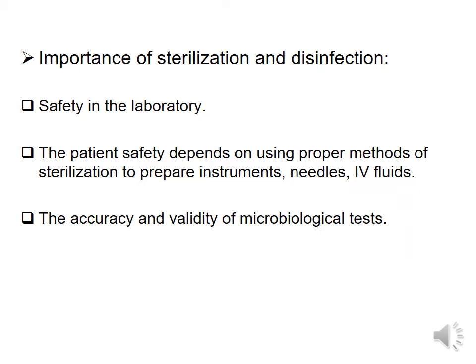The importance of sterilization and disinfection. First, safety in the laboratory. Second, patient safety depends on using the proper method of sterilization to prepare instruments, needles, and IV fluids, intravenous fluids. Third, the accuracy and validity of microbiological tests.